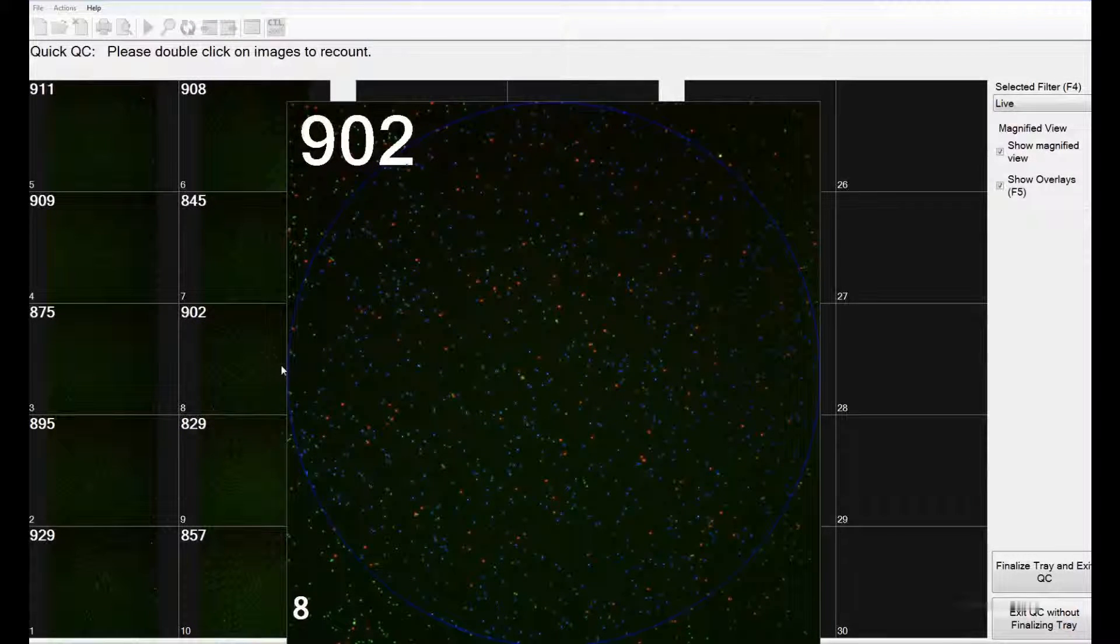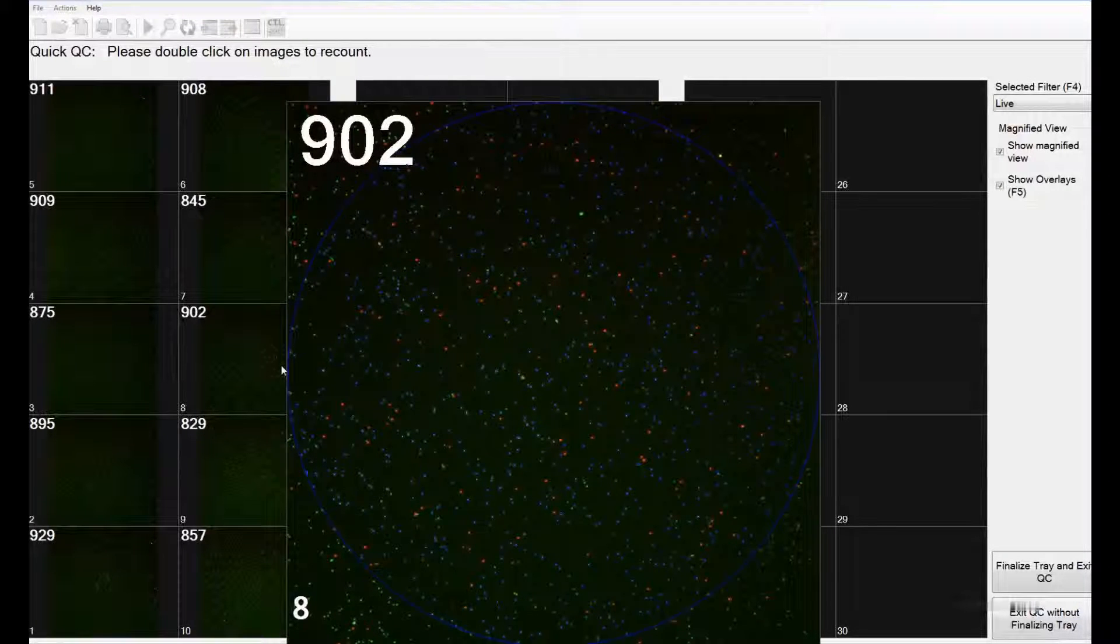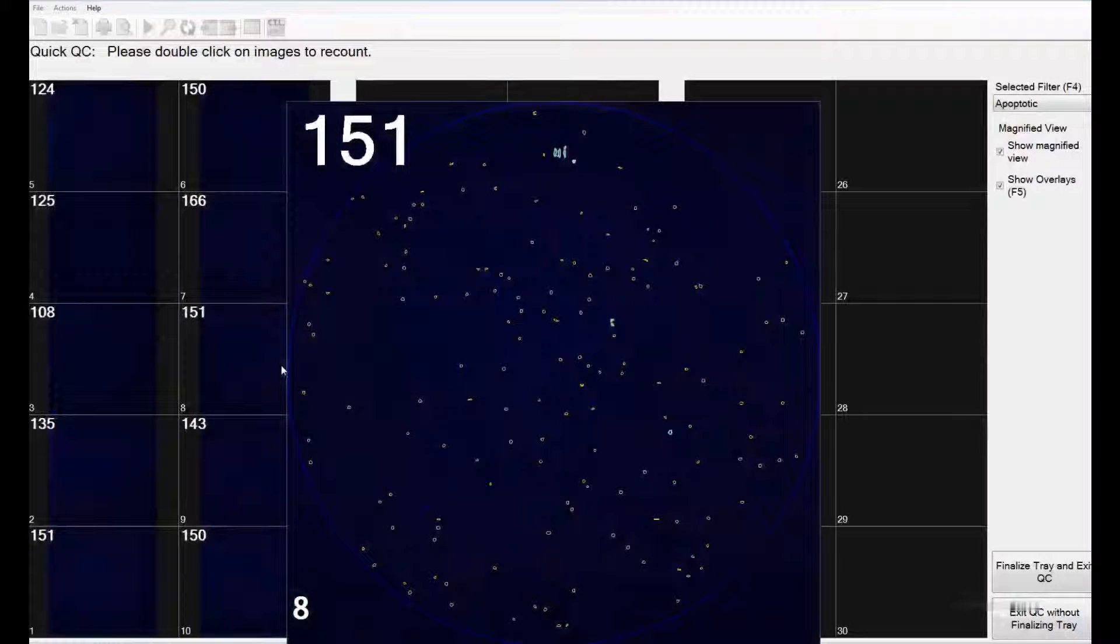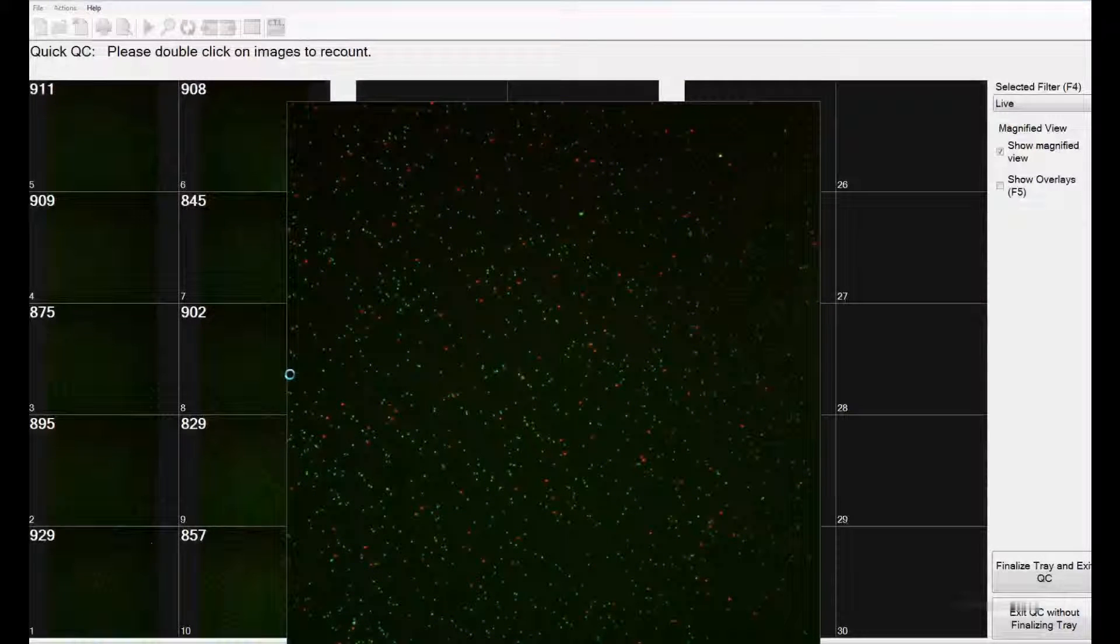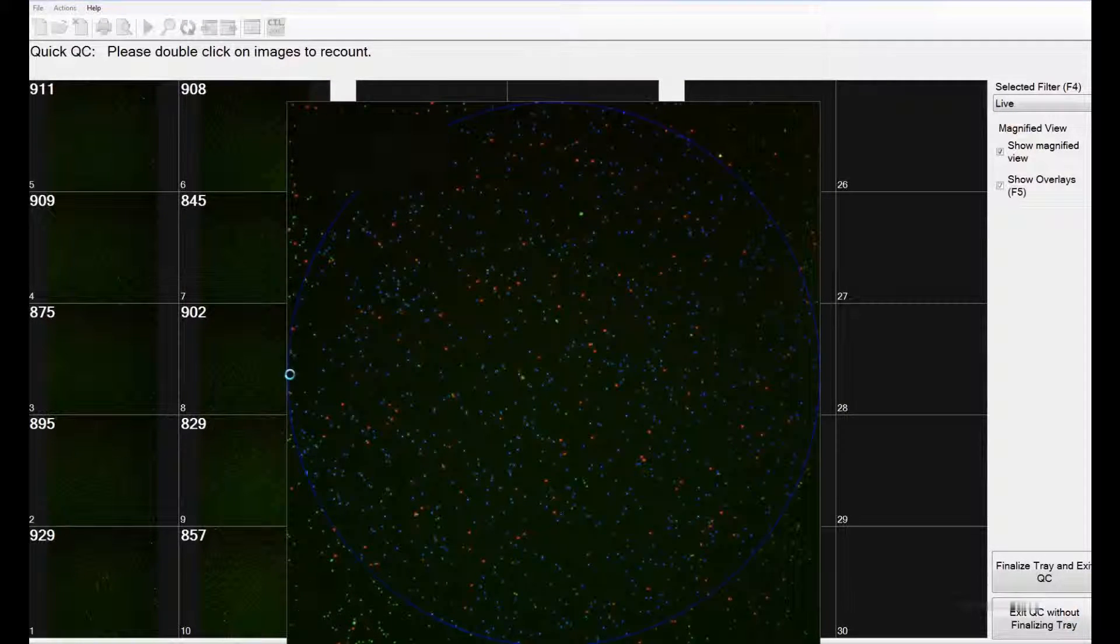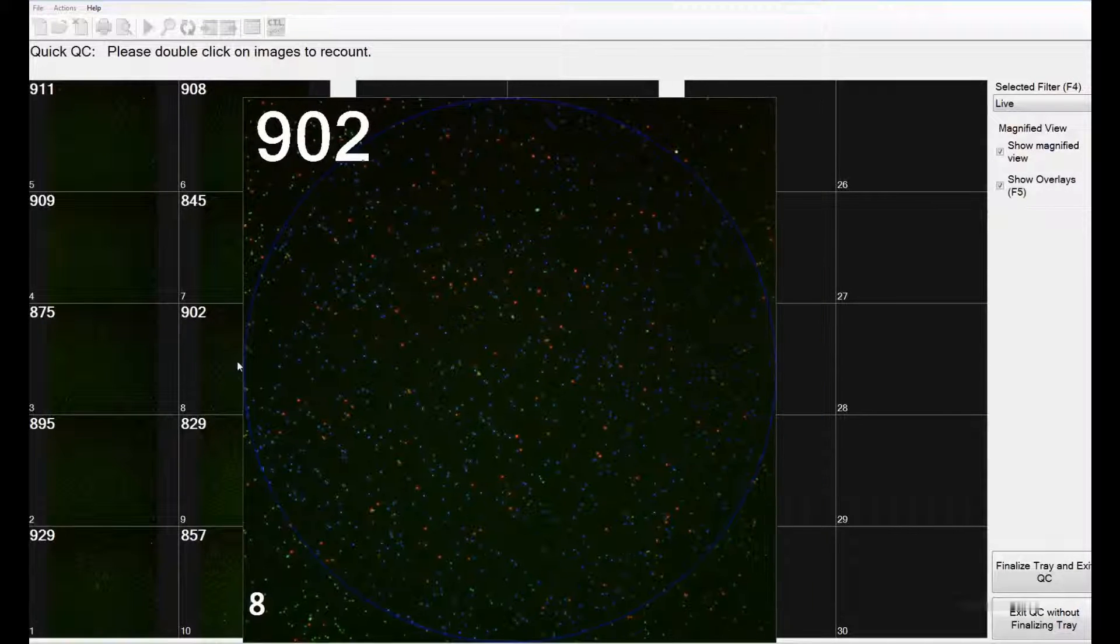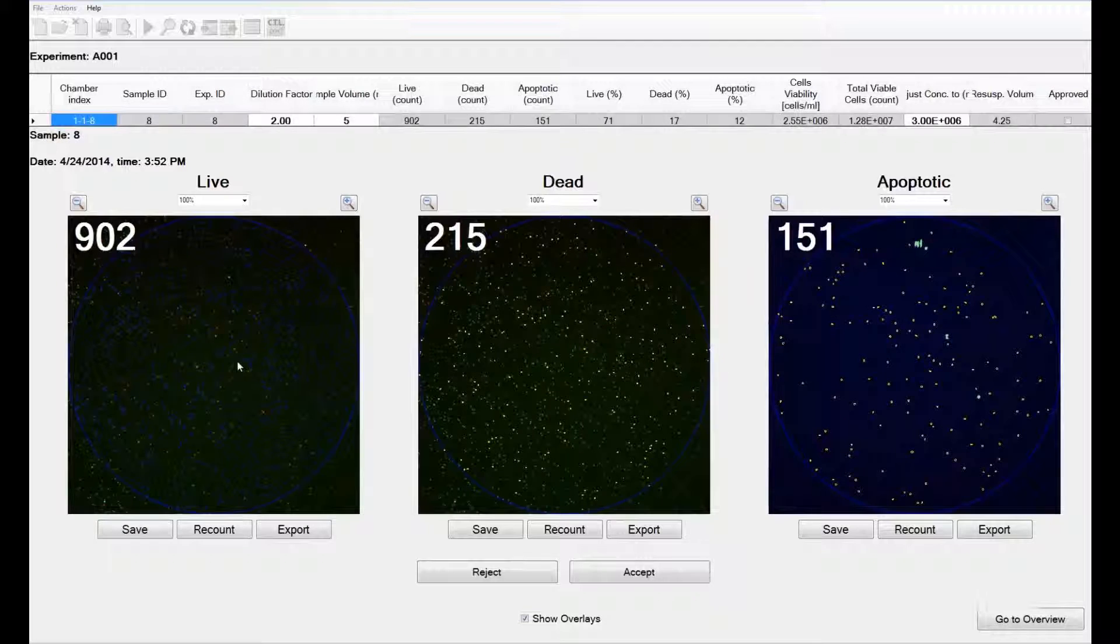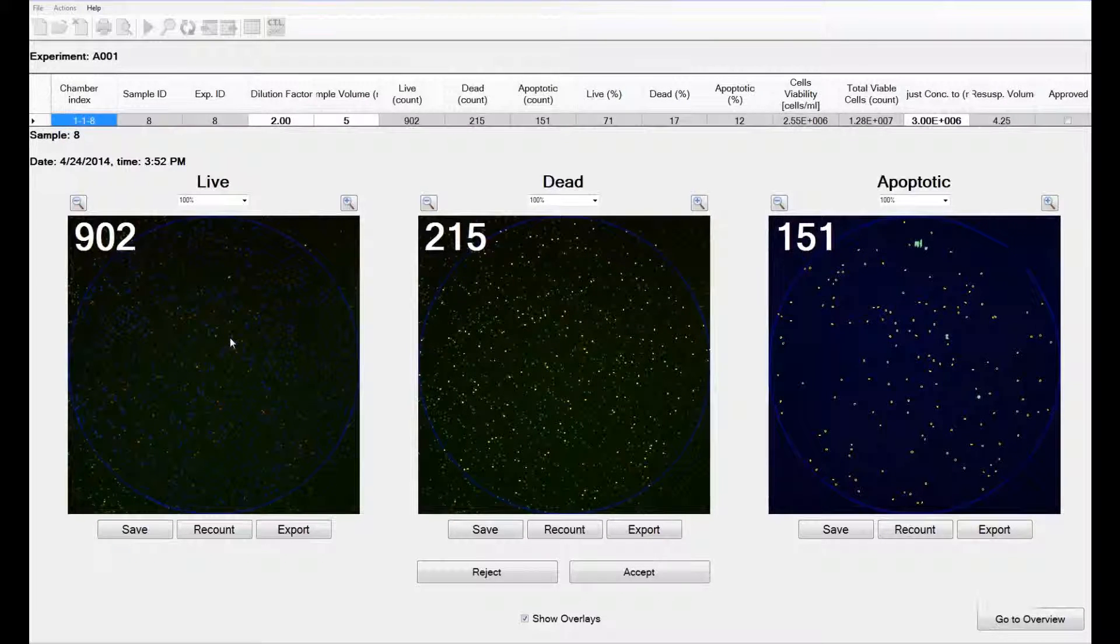To check live, dead, and apoptotic images, you can use the F4 key on your keyboard. To check overlays, you can use the F5 key on your keyboard. If there is a chamber that you would like to recount, you can do so by double-clicking on that. This launches the quality control mode.